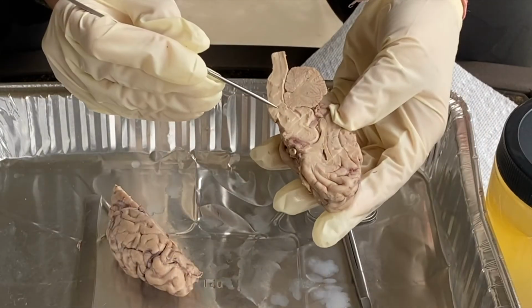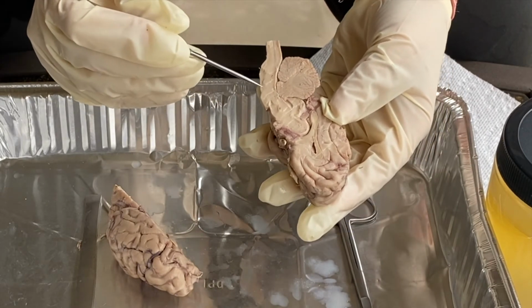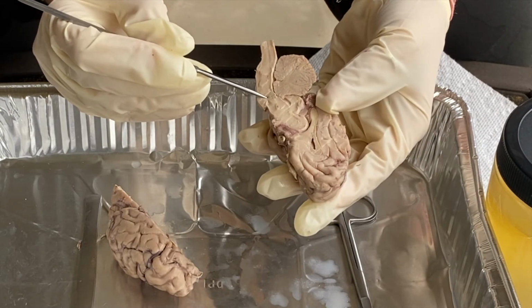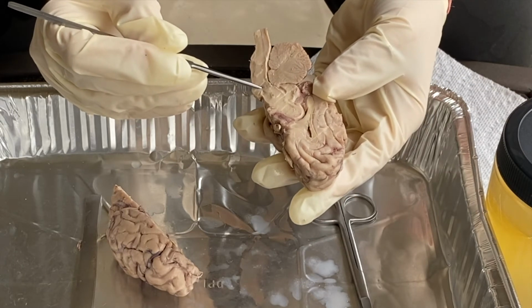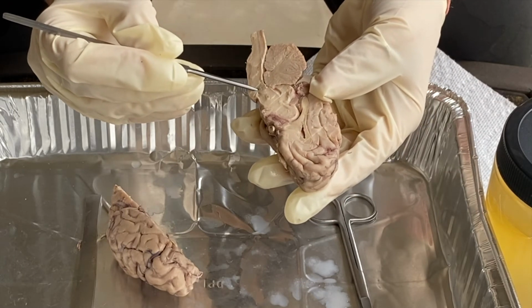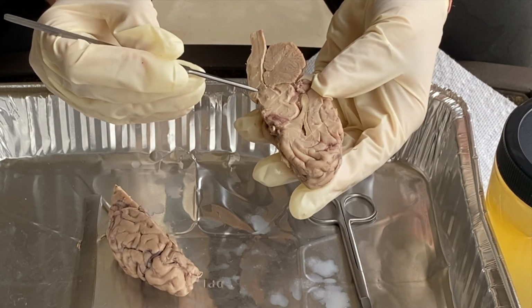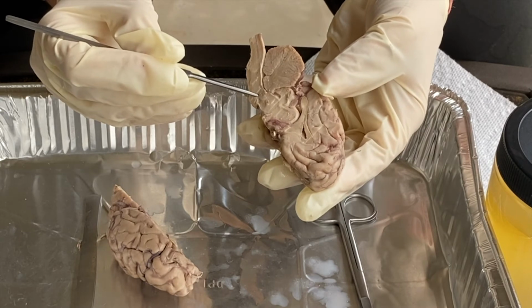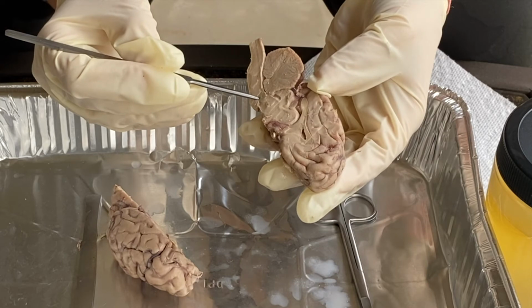So this is the pons, and it's responsible for the regulation and control of a number of vital functions. It acts as a control center, but it also contains nuclei of some important cranial nerves, and these nuclei relay signals from the forebrain to the cerebellum, and it also has nuclei that deal primarily with sleep, respiration, swallowing, and bladder control.